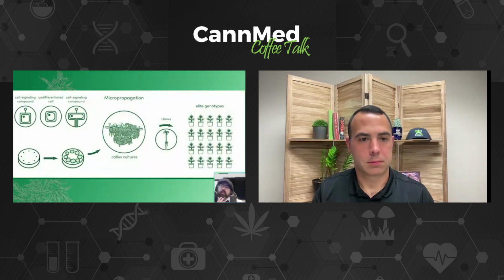So you'll take a cutting from those tissues and sterilize them. This is so that you only are dealing with the plants that you wish to deal with and not any of the pathogens or any of the other materials. You're only selecting for, say, for instance, meristem, which is like bud tissue, or you only want leaf tissue. So you just get that.